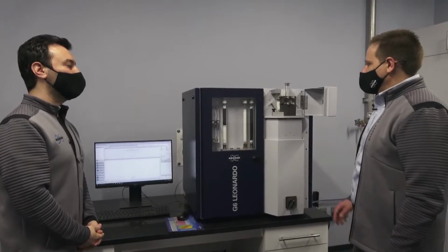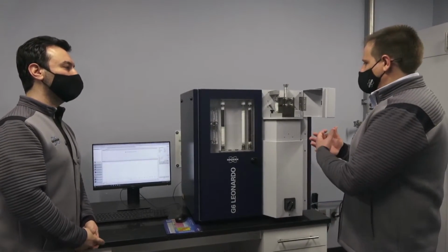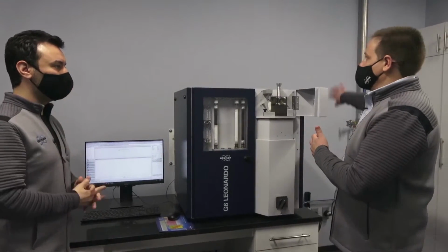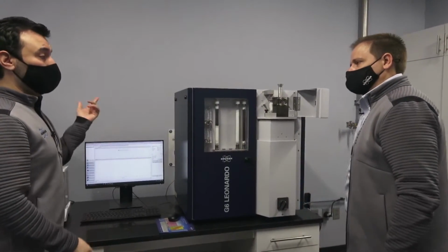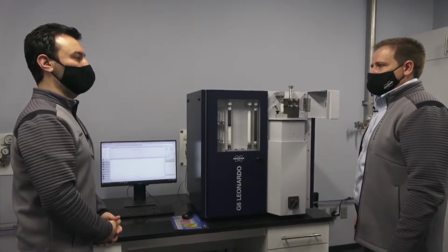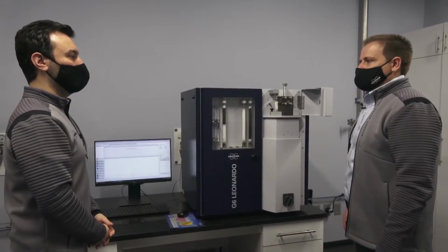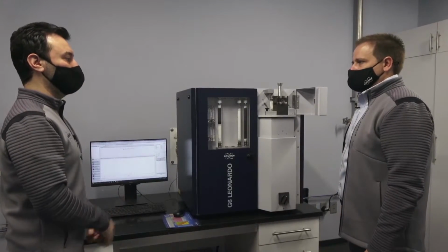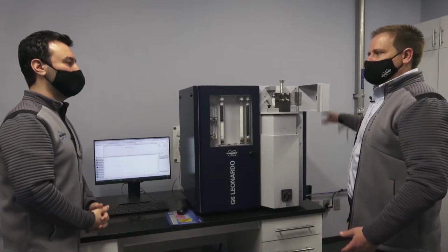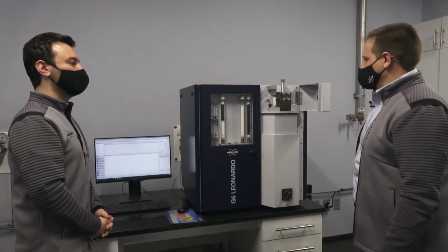And then from a safety perspective, once those gases have reacted and we've measured them, how do you exhaust that? Does that go out a vent or something? Yeah, there's an outlet at the back. With a hose, you can just use a fume extractor or something. Or if you have a line in the building, you can also connect it so it will be exhausted. So kind of like if you had a fume hood hooked up. Yeah, that's the type of setup that you'd use.